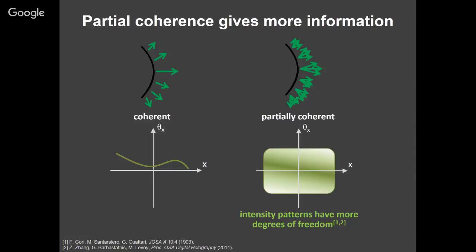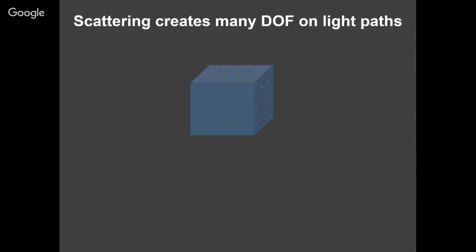Okay, so I want to talk about scattering, and you need this if you want to do neural activity tracking. This is one of the classic problems of optical imaging: trying to invert scattering, trying to image things through scattering material. And of course, everybody knows this problem, right? You would like your light to go straight through the object, and some of it does, very little of it does, but a lot of it gets scattered. It bounces off these little scatterers in the object and randomly changes direction and then comes out at some other random direction, right?